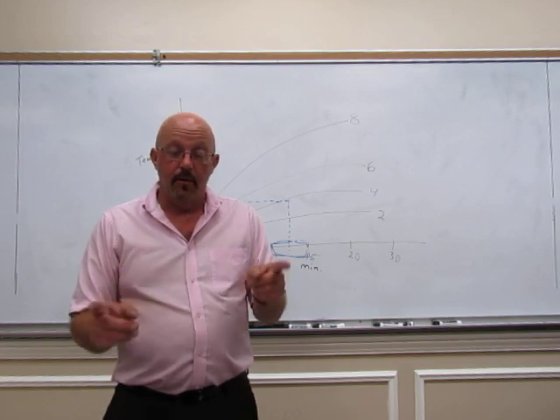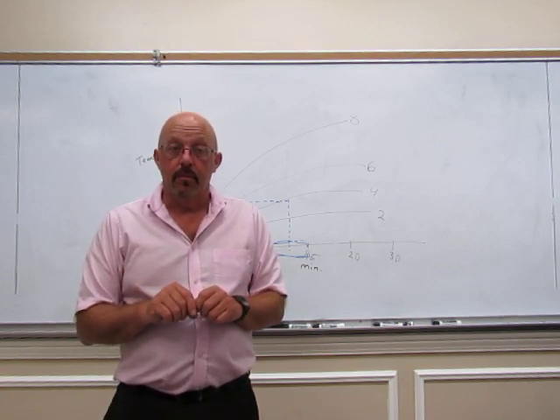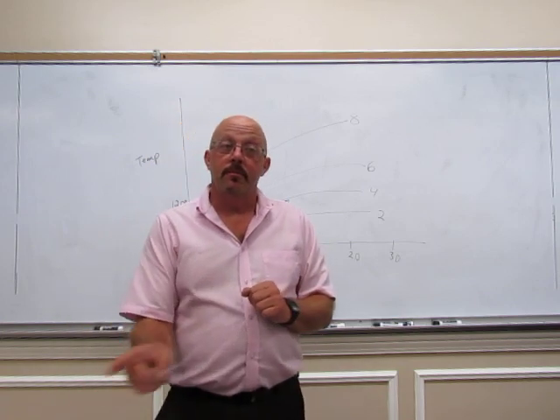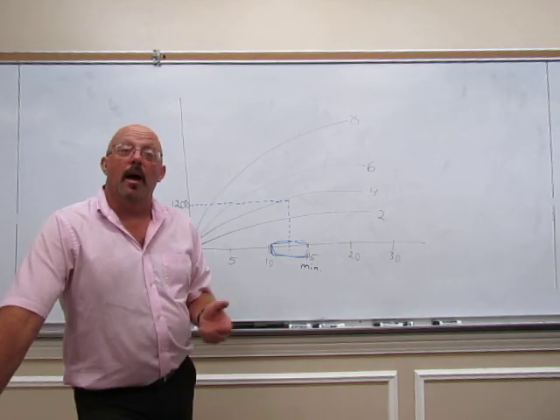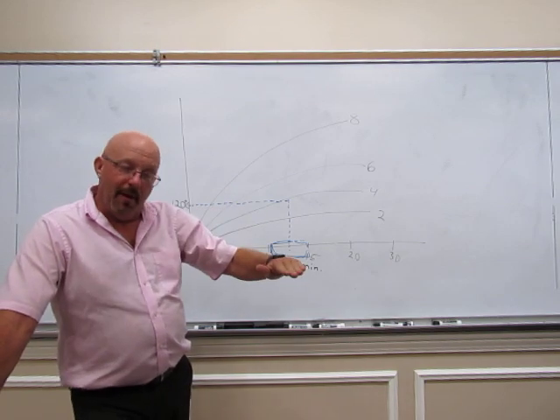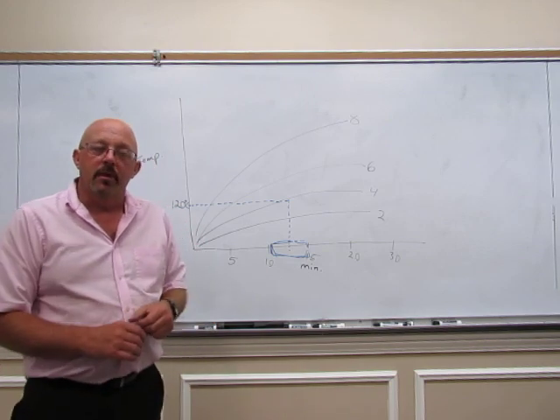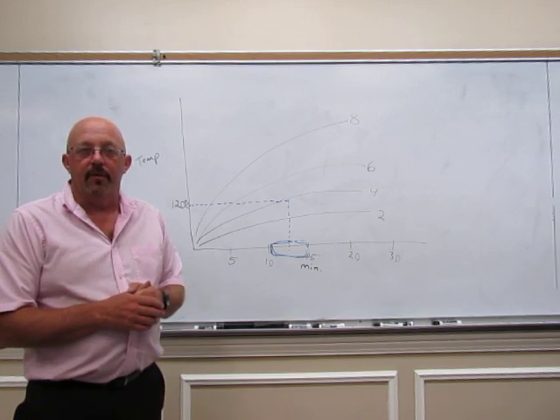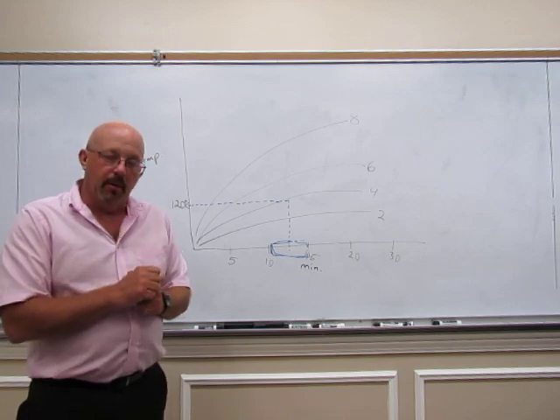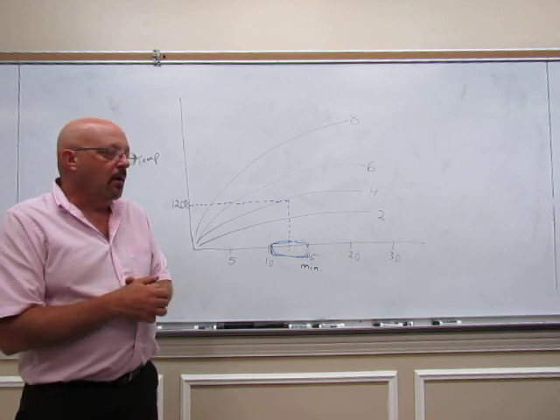But one thing we can do to help confirm that they are the same is to take and mix those two. Mix them, and then take a melting point of that mixture. If they're not the same, if they are different compounds, what will happen? Well, one will be an impurity in the other. So that would lower the melting point and broaden the range. So if they're different compounds and you mix them, it acts as an impurity, so we can tell they are different. If they are the same compound and you mix them and take a melting point, then it should still melt at 100 degrees, if that's what the original compounds melted at.